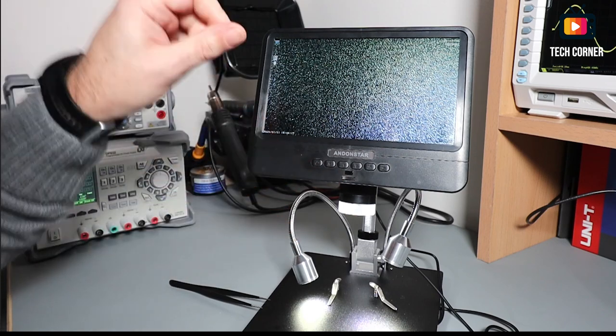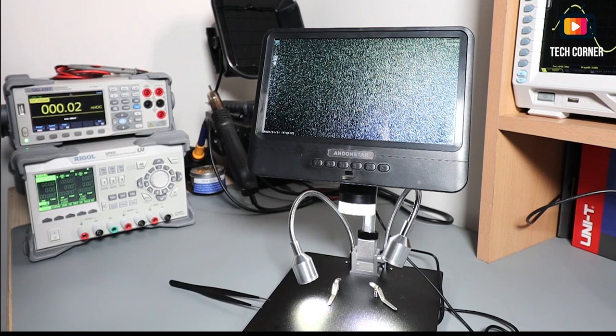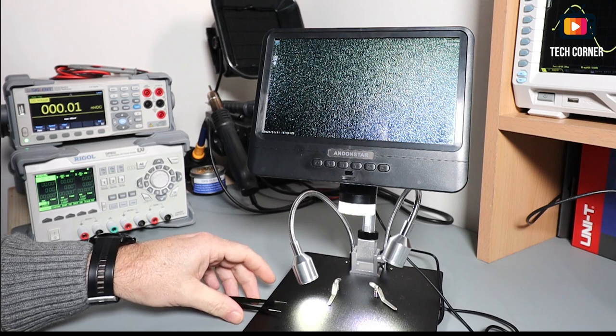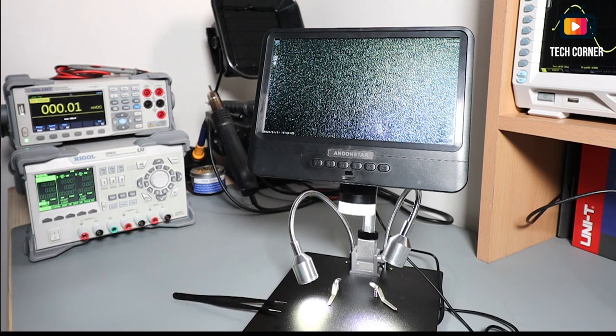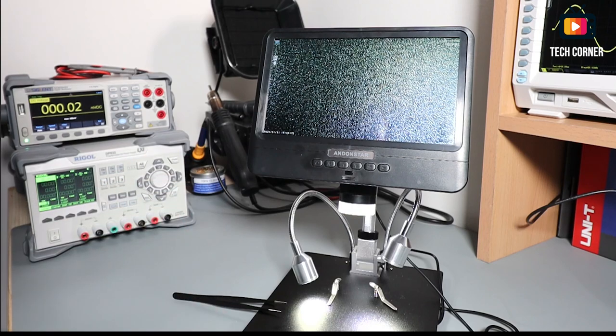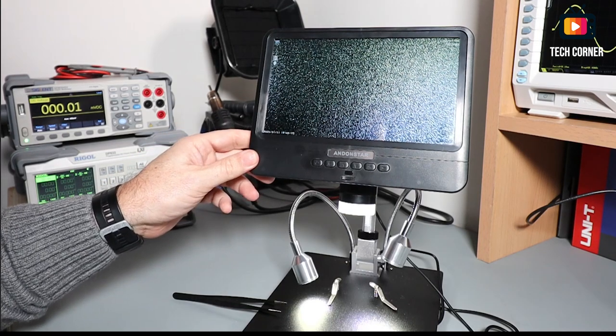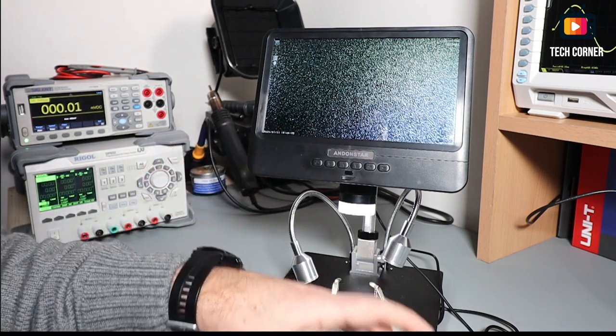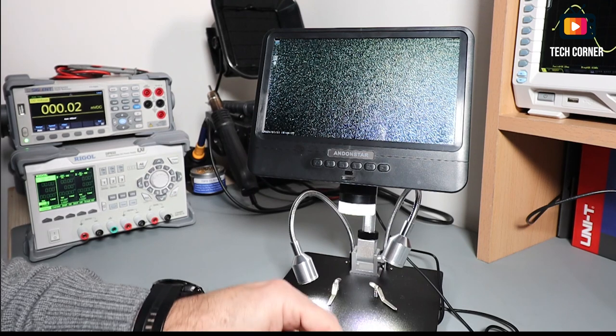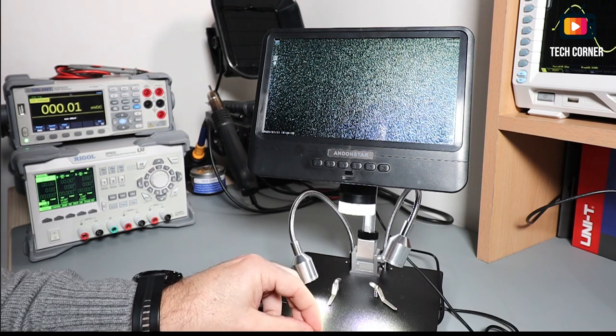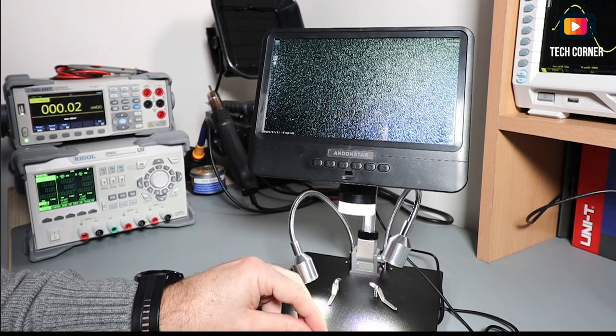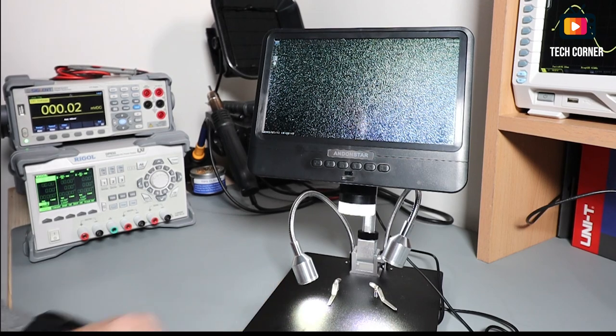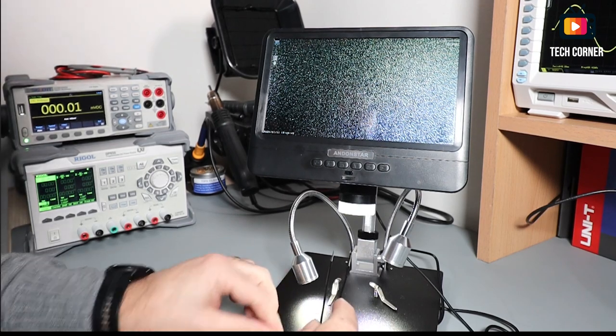On the back we have only the SD card slot and the USB slot for connecting the power. Let's try to see what is the resolution of this, and if it can make a good image or not.